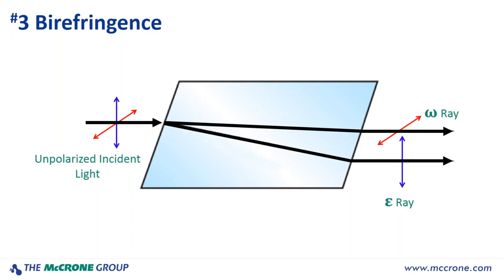Birefringence is caused by light passing through substances that have at least 2 refractive indices. The light rays are split into the component parts as they travel through the substance. The light rays travel at different speeds due to the molecular structure of the substance, 1 slow, 1 fast, relative to each other. When the rays recombine as they exit the substance, they are out of phase relative to when they entered. The recombination of this out of phase ray results in color, and this is birefringence.